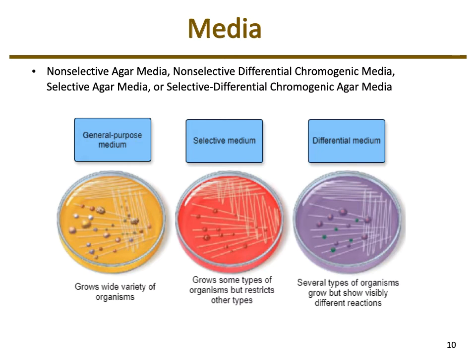With a differential media, it can be either non-selective or selective, but in many cases it is selective, so not as many organisms grow. What's unique with the differential is that they change color. Depending upon the organism, if they undergo a certain metabolic pathway and utilize some of the material, they would end up changing color.